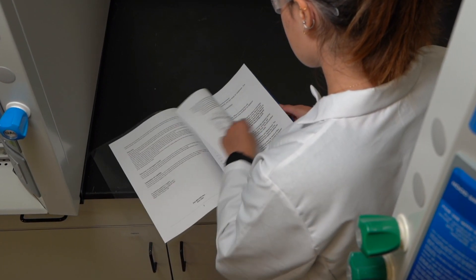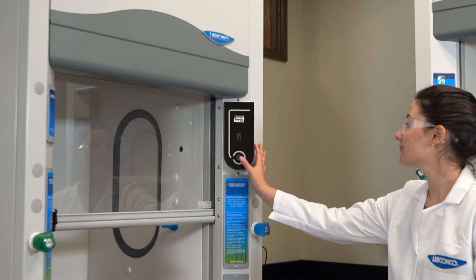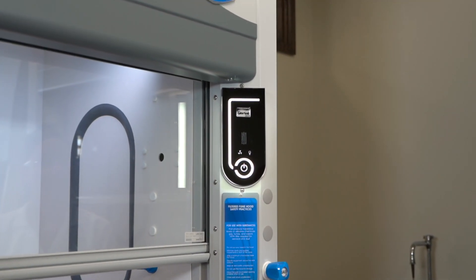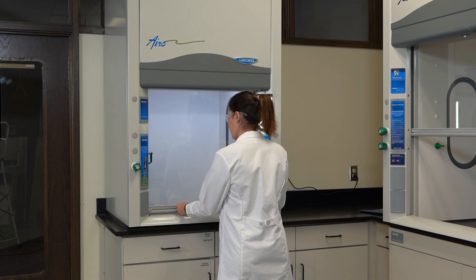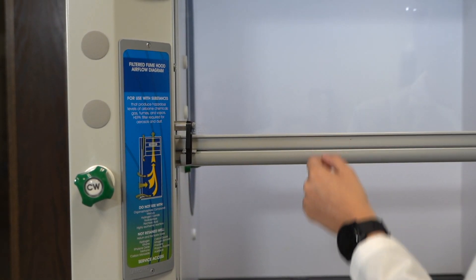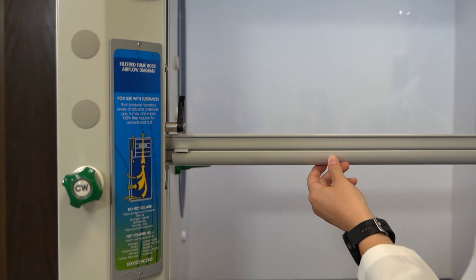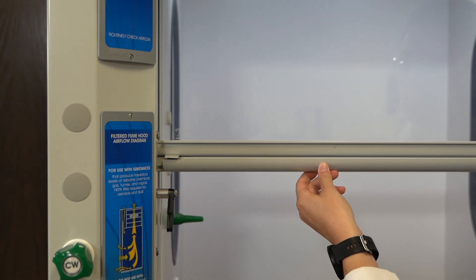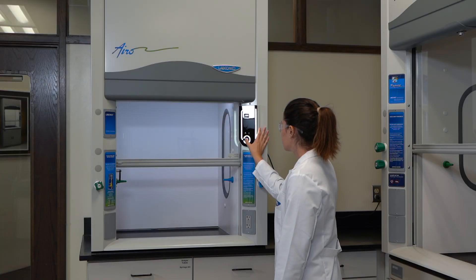Locate the airflow sensor calibration instructions in the manual. To calibrate your filtered fume hood, adjust the sash to the desired working height and then adjust it upwards another 2 inches. Press the calibration button, followed by holding down the fan button to begin calibration.